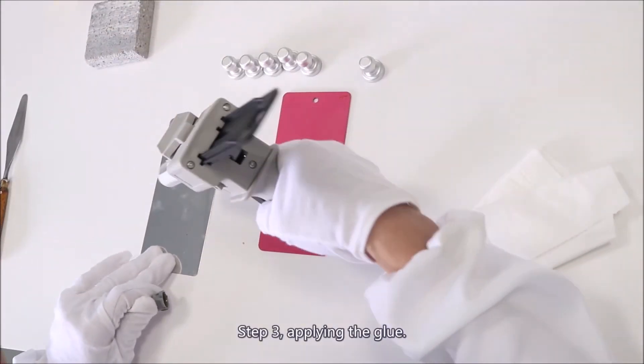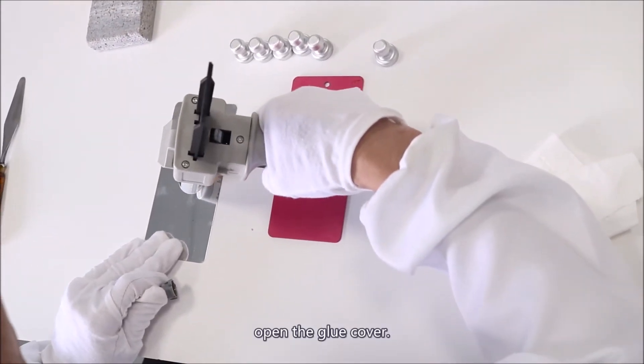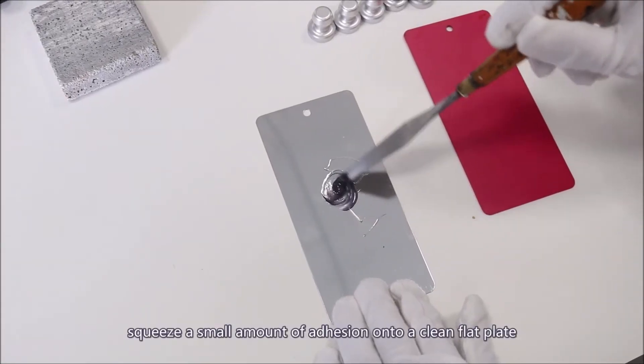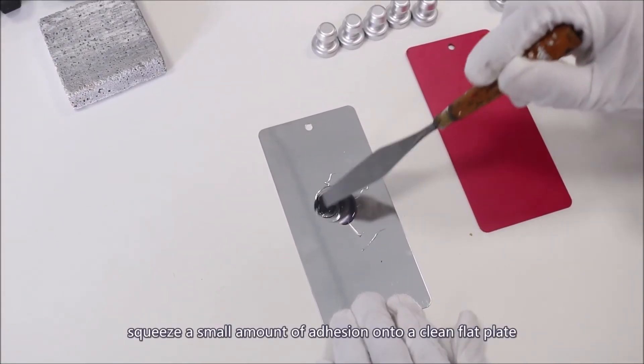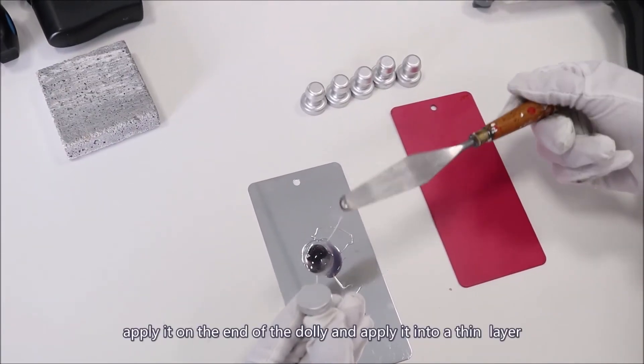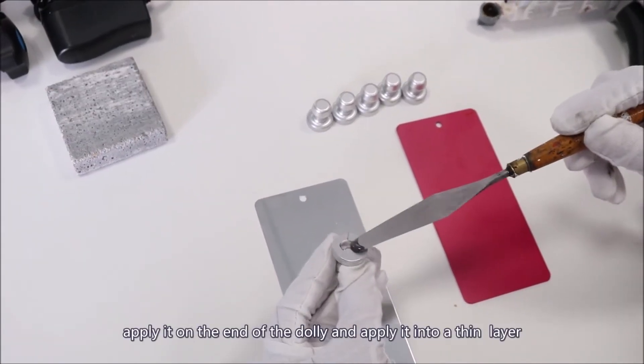Step 3: Applying the glue. Open the glue cover. Then lightly press the glue gun trigger. Squeeze a small amount of adhesive onto a clean flat plate. Gently mix it with a spatula. Apply it on the end of the dolly in a thin layer.